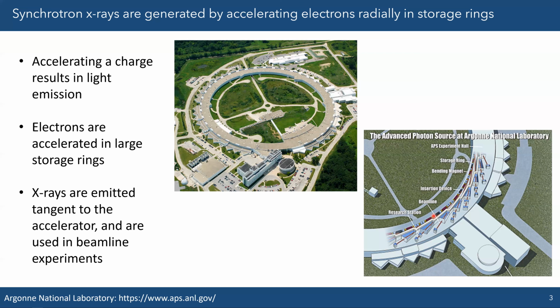They're very specialized locations, these synchrotrons, but there's a good amount of them throughout the US. A lot of us are here in California, and we have two in California: one at Berkeley, the Advanced Light Source, and one at Stanford, the Stanford Synchrotron Radiation Lightsource, SSRL.